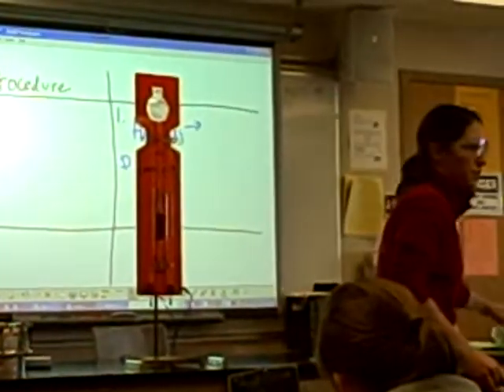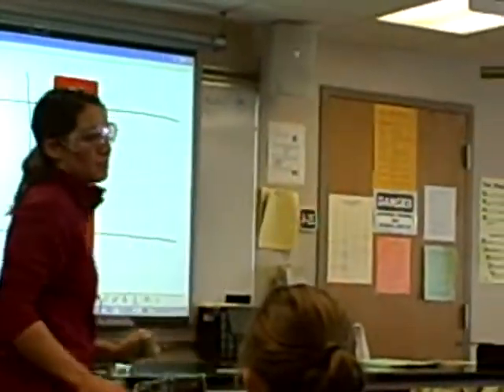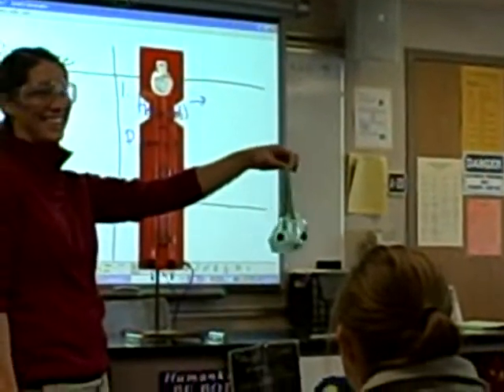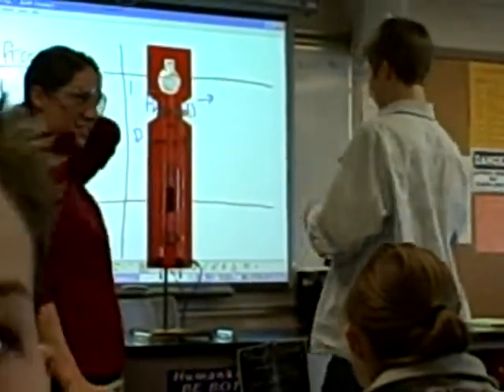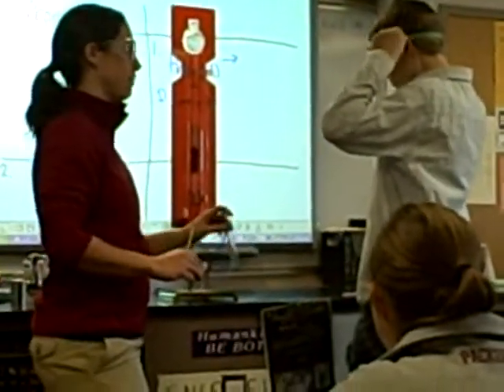Who wants to give me my cover? Who did it last time? Nick did it last time. Let Mark do it this time, since he didn't get to hold the camera. Hydrogen first. Just tighten them up.